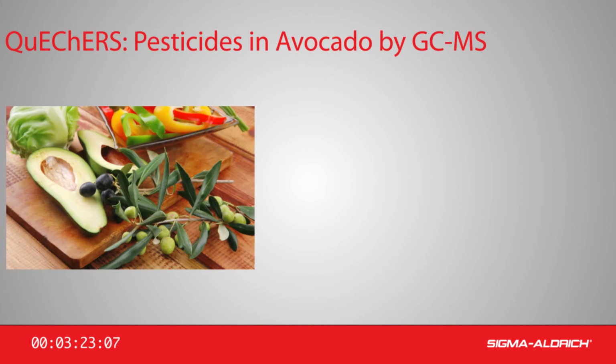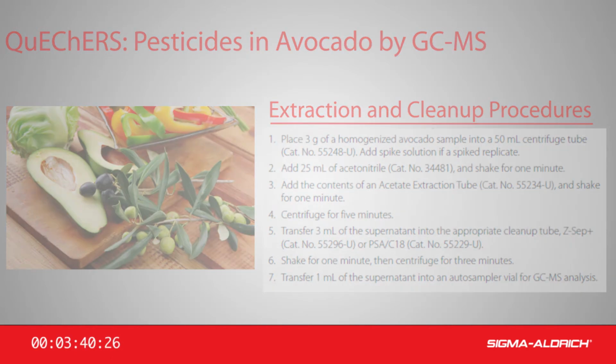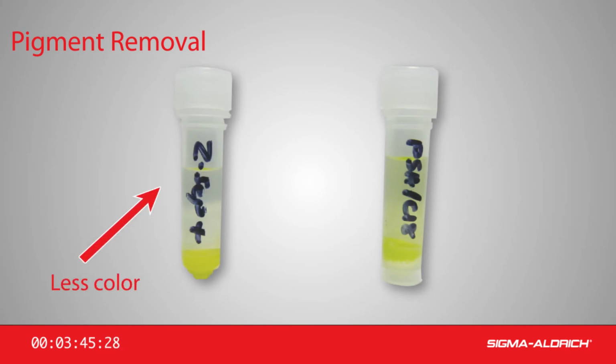An experimental study compared the use of Supelco Z-Sep Plus sorbent versus PSA C18 for the cleanup of avocado extracts prior to pesticide residue analysis by GC-MS. The applied procedure was similar to that of the AOAC and EN official QuEChERS methods. After QuEChERS cleanup, the extracts were visually compared. Less color remained in the extract on the left, which was cleaned with Z-Sep Plus, compared to the extract on the right, cleaned with PSA C18, indicating that Z-Sep Plus has a greater capacity for pigment removal than PSA C18.